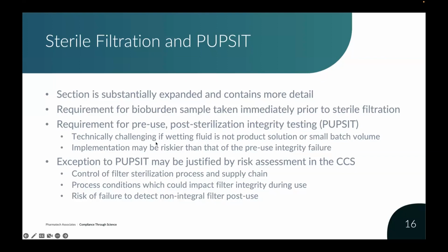The reason this has continued to be argued is that many feel that the implementation of integrity testing, since it's post-sterilization, and you're frequently now in a clean room, in an aseptic environment, trying to perform the integrity test, and how you do that test, may be riskier to the sterile filtration setup than the probability of having what we'd call an undetectable pre-use integrity test failure, right?